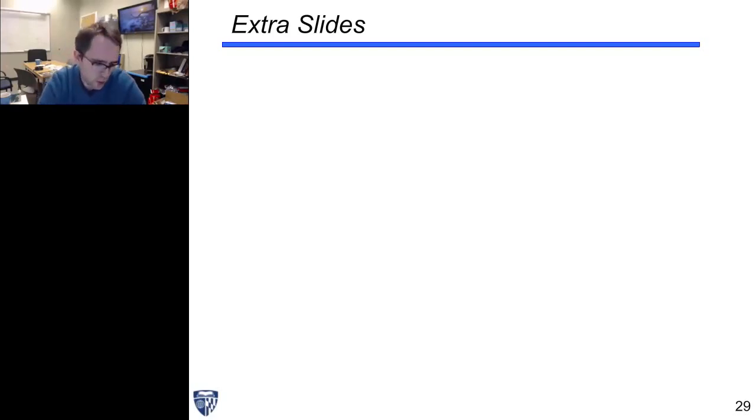Great question. So the answer is yes. We have already shown, in work I didn't present today, that we can capture out to 5 kb, 5,000 bases long. And we're still striving to get it longer.